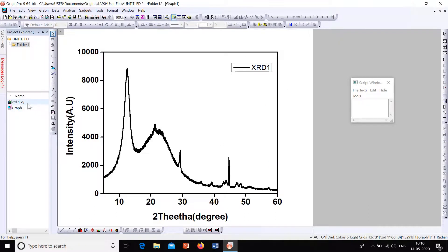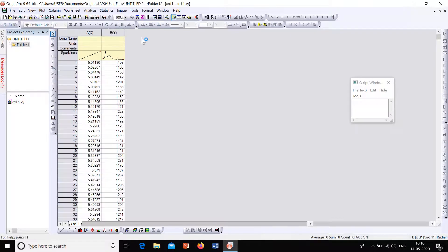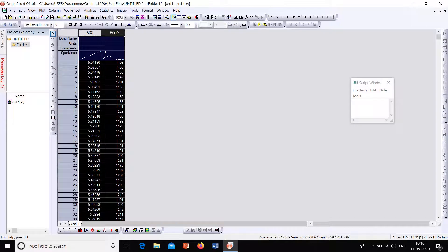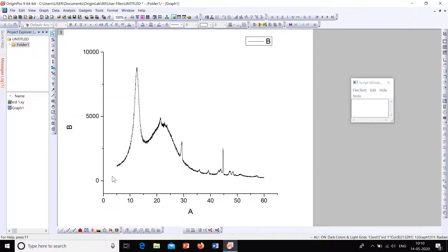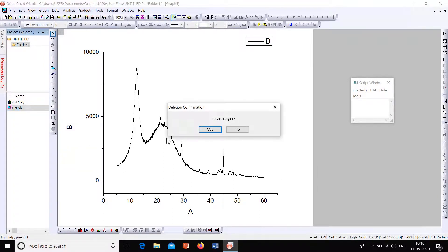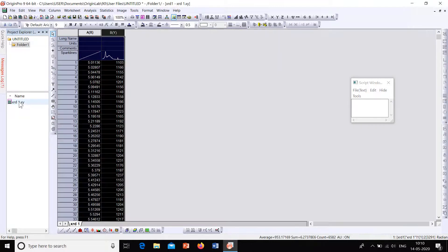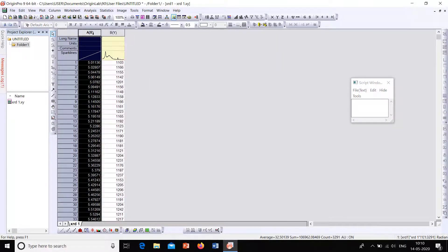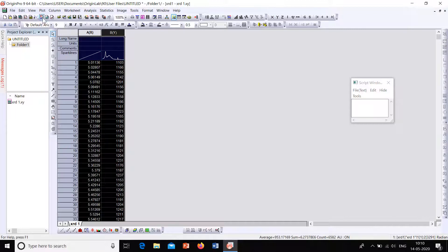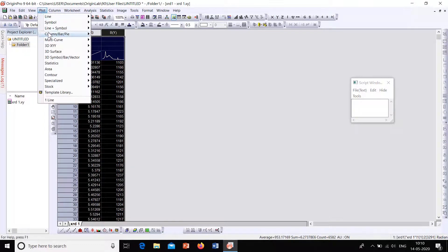Let's test this. Delete the current graph and I'll show you what happens without using the template. Select the data and plot — it will be the ordinary unformatted XRD that we saw earlier.